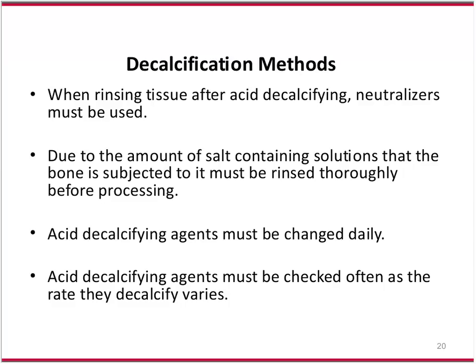And if you do not rinse your samples out, when you change your processor at the end of however many runs your lab does, when you're dumping the ethanol, you're going to see that there's a lot of salts going down the drain. Our processor starts in 70% ethanol. We don't even have neutral buffered formalin on our processor, but we still see the salt. So, I mean, if you have NBF as the first station of your processor, you'll see more salts. But however you choose to do it in your lab, if it works for you, keep it that way.